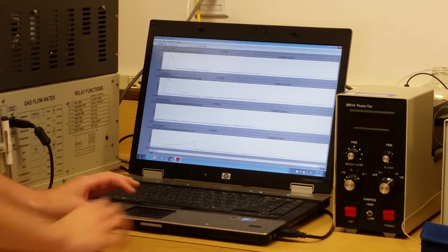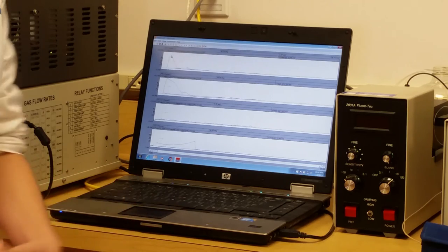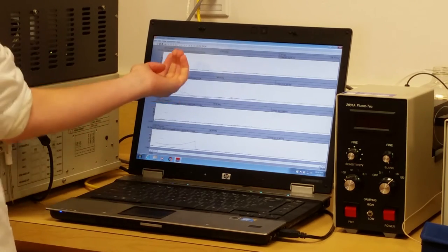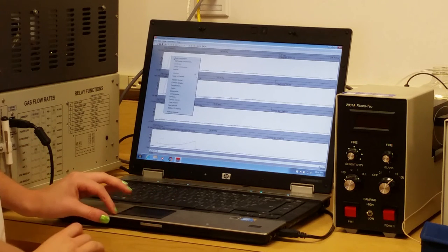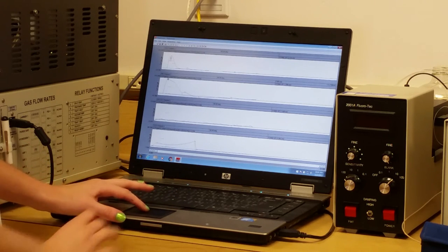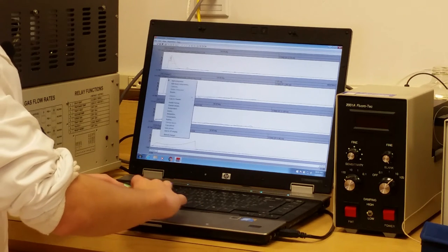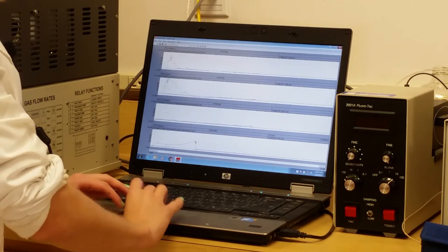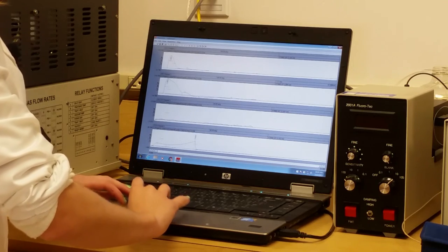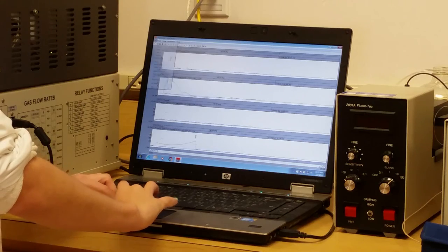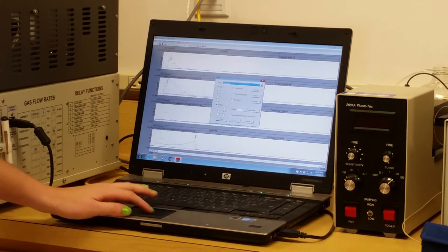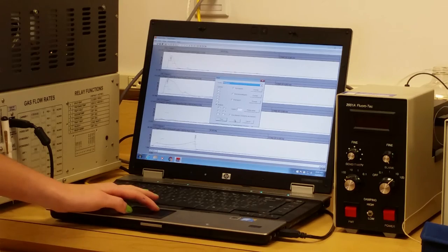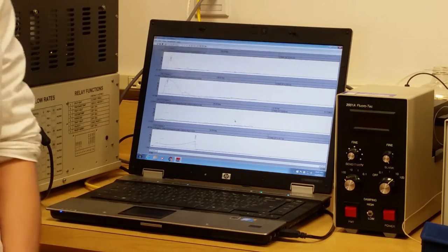So to process the scan, we're going to add in the retention time of each peak. This is the time it took to get to the top of its peak. You left click and add component. You want to do this for each one there's a peak. When all the retention times are added, you can print the scan. You go to file and then print. And it'll print.